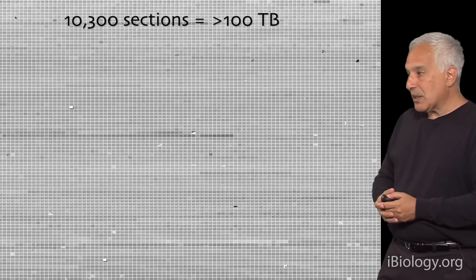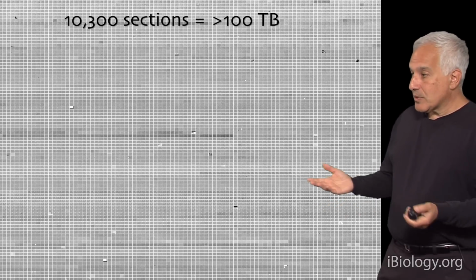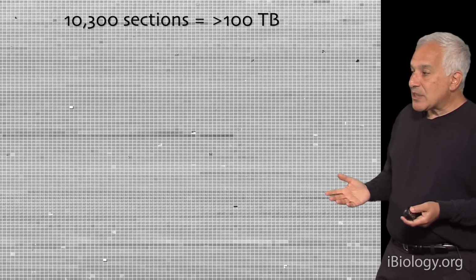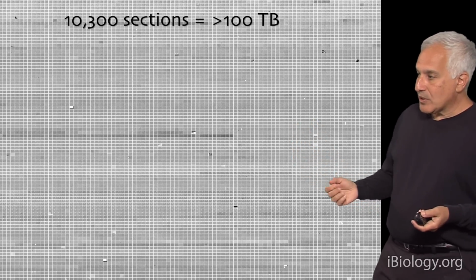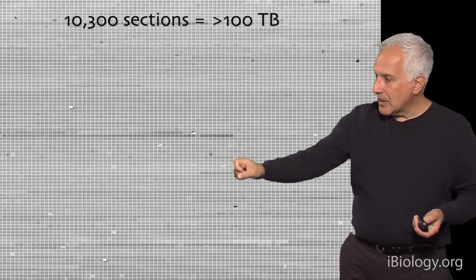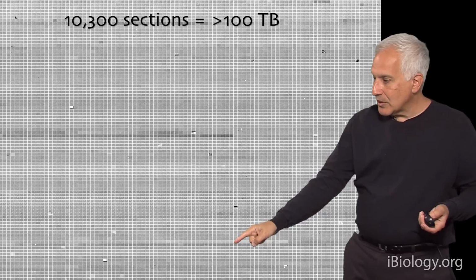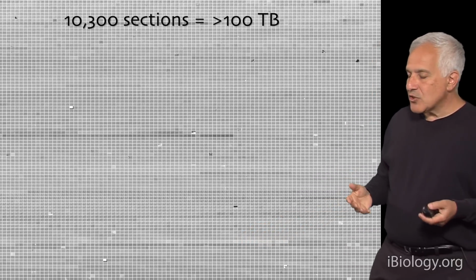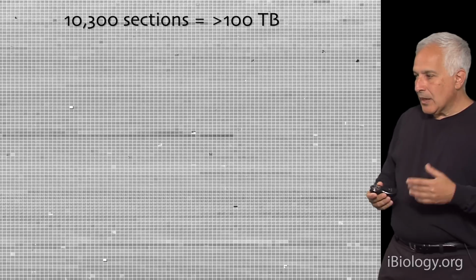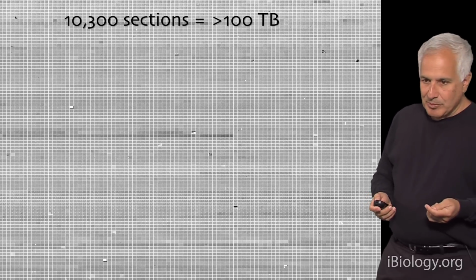When we talked to the company that made this microscope, they said, what do you expect? You know, this is a crazy amount of data. We never tested a machine for such long periods. Notice here also that the images got progressively darker, and in another place down here, they got progressively lighter over time. Machines are not yet designed, optimized for this kind of continuous imaging. Eventually, these problems will be worked out.